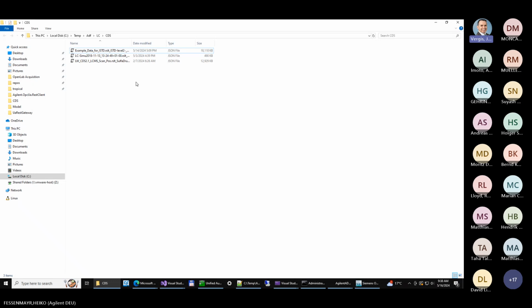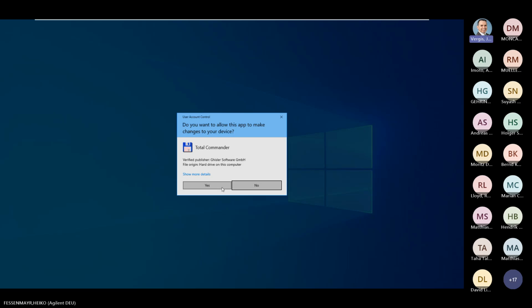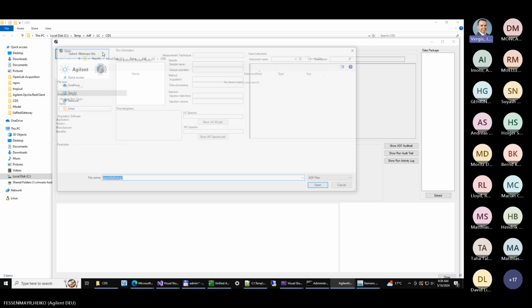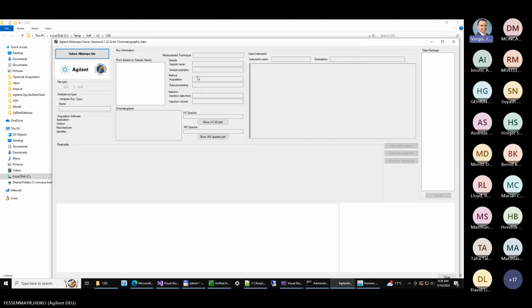I have taken some LCMS data and I turned this into the... it's gone now. Okay. Just a minute. So this is the data I have. I will show then in the OPC-UA world. So it's a liquid chromatography mass spectrometry run, which has been transformed into an ASM.